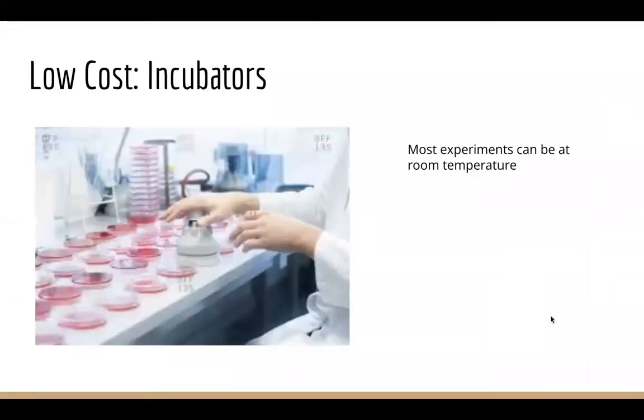And then we've got incubators. So a lot of the time, people will think that to get their first laboratory together, they have to spend lots of money on an incubator. But in fact, if you're not doing lots and lots of serious work, or if you need something below a certain temperature, you can just leave it on the side if it's an agar dish, and it will grow. It won't be as accurate in some cases. I'll talk about that in a bit. But you can actually do lots of microbe work without incubators.